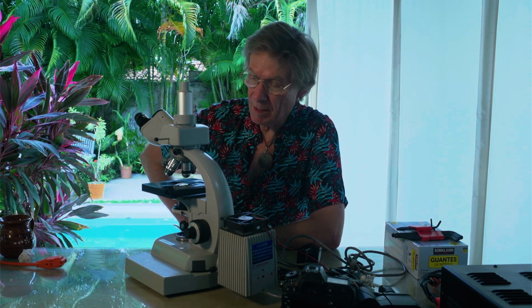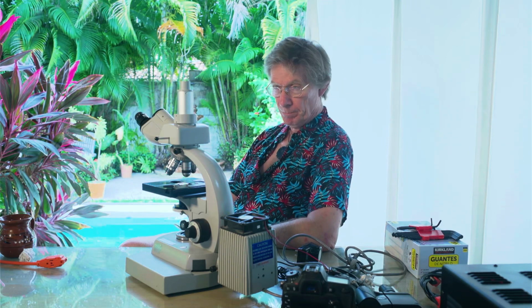The reason, well, there are a number of reasons actually. Number one is that the reproduction resolution of these microscopes is about as good as you can get. And in the early 1980s, the companies manufacturing microscopes reached what's called the epitome of resolution in light microscopy. So it hasn't really gotten any better than it was back then.